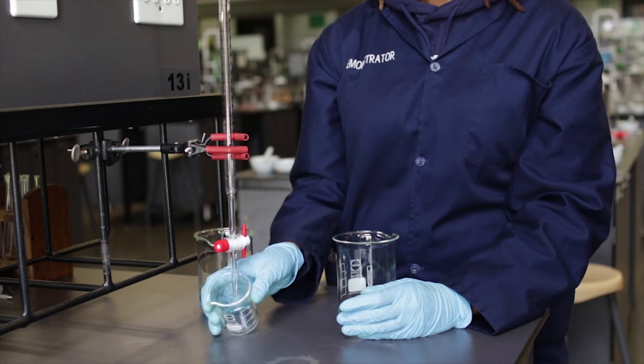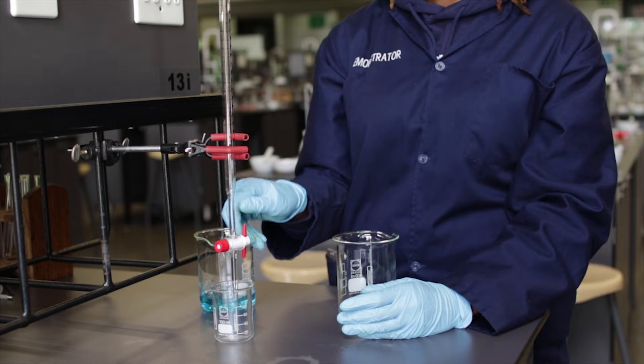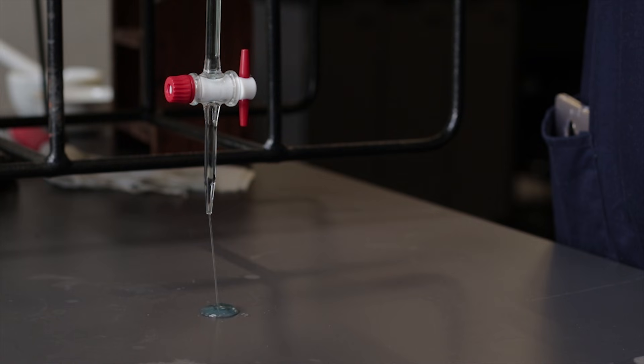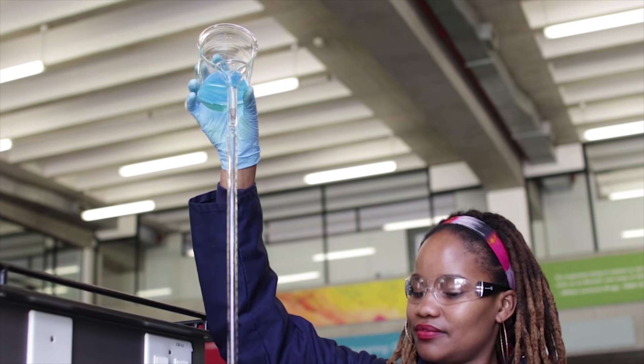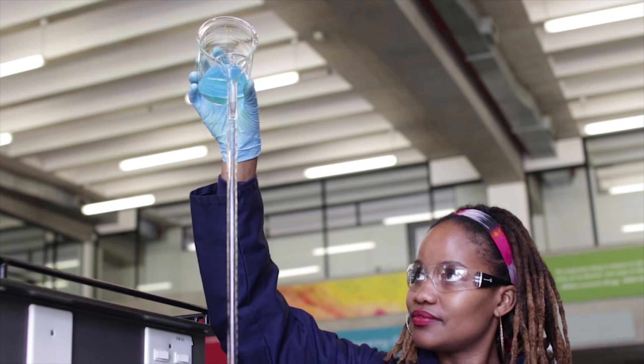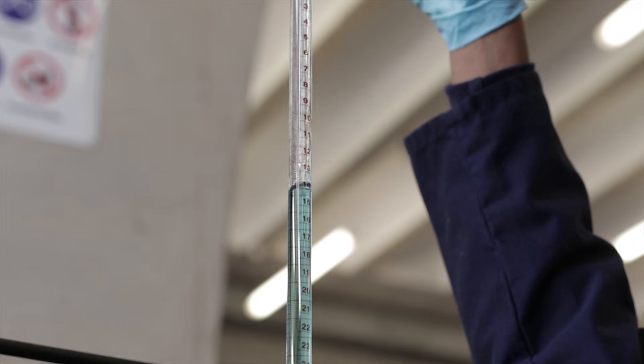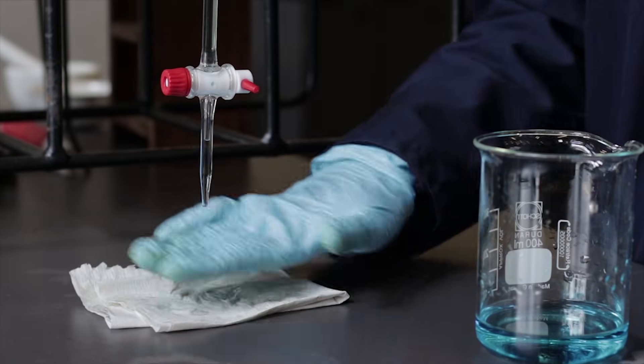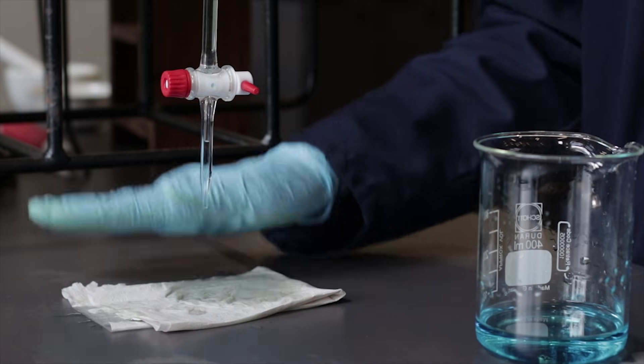We recommend that an empty beaker is placed under the tap of the burette while filling the burette. This is just in case the tap is left open before filling the burette. When filling the burette be careful not to spill the solution on the outside of the burette. If there is a spill the chemicals must be cleaned up as soon as possible with a paper towel.